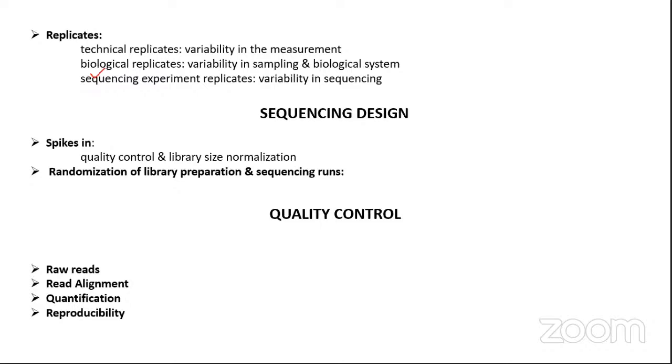Say suppose I have one tissue X. Then what is my aim? We are doing the RNA extraction first. The data generation depends on the amount of X, how much tissue I am taking, and then how much RNA I am getting from it.